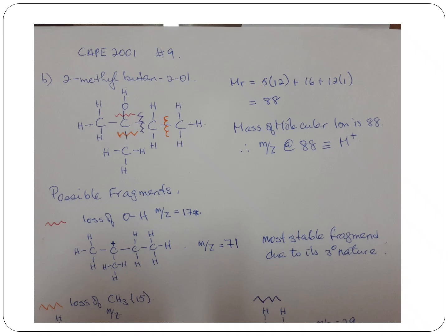So if you have a look at what I've done here, there are some examples of the structure. So I've drawn the entire structure out, 2-methylbutan-2-ol.